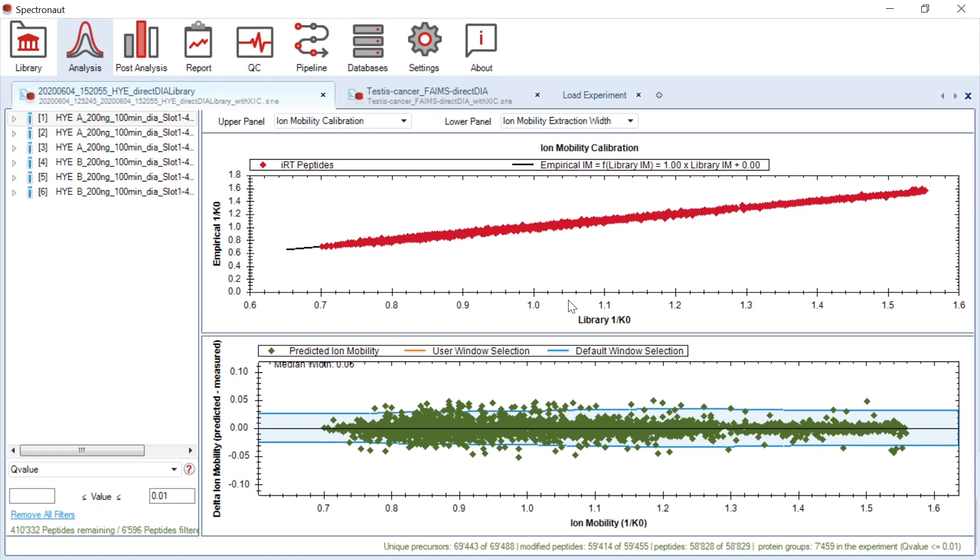Secondly, you can visualize the ion mobility extraction width. As you probably remember, I was showing you an option to select how you want to perform XIC extraction in the ion mobility dimension when we were talking about the DIA extraction.